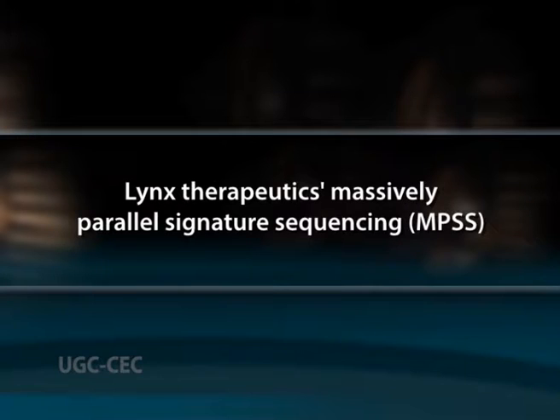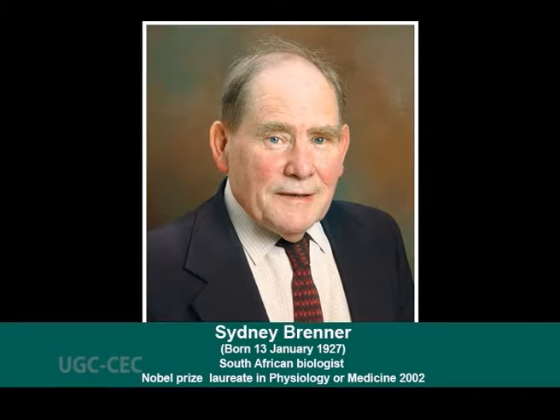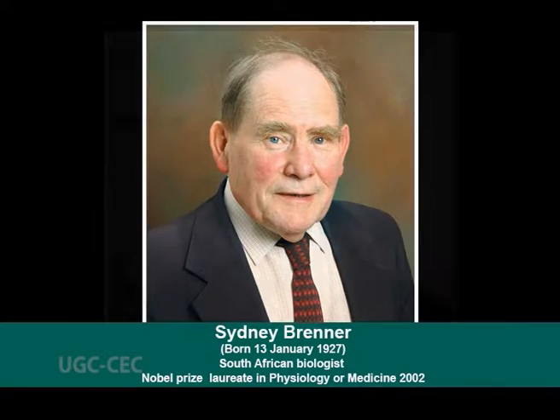First one, Lynx Therapeutics Massively Parallel Signature Sequencing, or MPSS. MPSS was developed in the 1990s at Lynx Therapeutics, a company founded in 1992 by Sydney Brenner and Sam Eletr, which is the first of the next generation sequencing. By applying this method, almost every transcript in the sample will be revealed and provide the expression level with high accuracy.